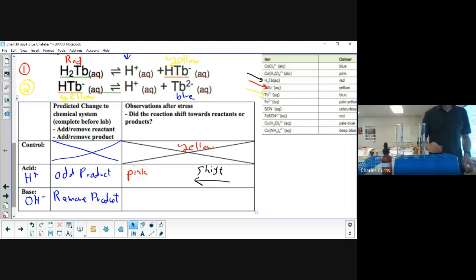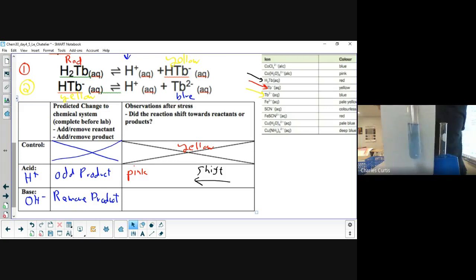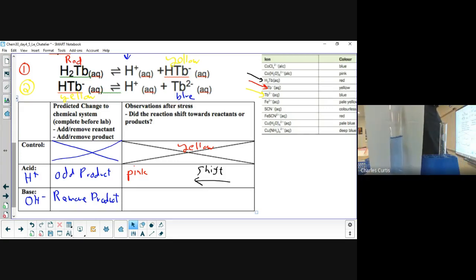The last part, we'll add a base. I'll first do this to a new mixture. So I've got yellow. Add a few drops, and it looked like a little bit of blue formed on the top. Let's add some more. Yeah, it is a nice blue. So blue is on the bottom, so we did yellow to blue, which is going towards products.